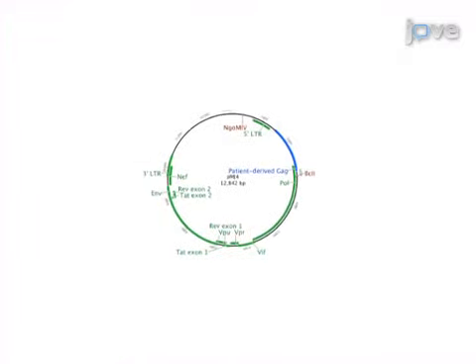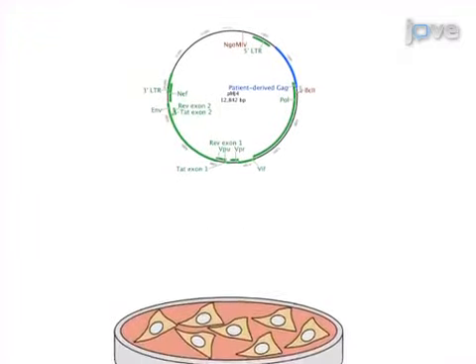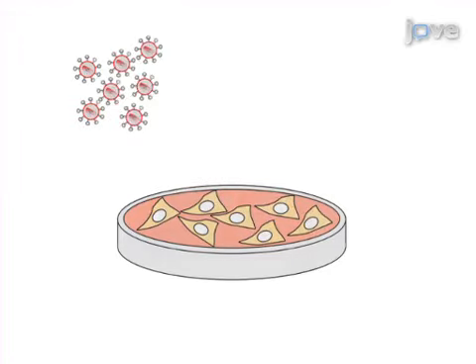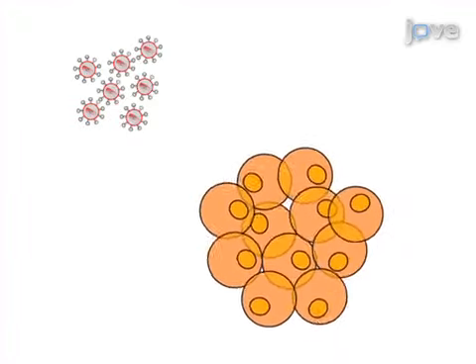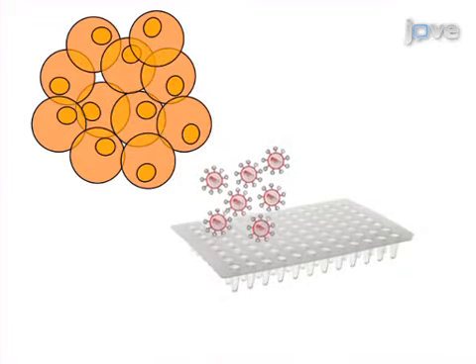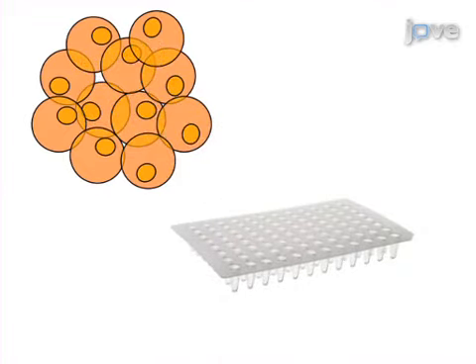Next, the GAG MJ4 chimera plasmid is transfected in order to generate infectious viral stocks and titered to assess infectivity on an indicator cell line. The final step is to measure in vitro replication capacity in the GXR25 T-cell line.